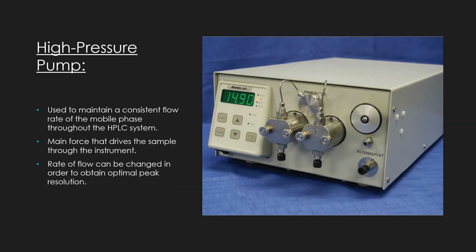The high-pressure pump is used to maintain a consistent rate of flow of the mobile phase throughout the HPLC system. This is the main force that drives the analytes throughout the system. This rate of flow can be changed in order to obtain optimal resolution of certain analyte peaks. Depending on the composition of the mobile phase, there will be an optimal flow rate which will offer the greatest resolution for that analyte.